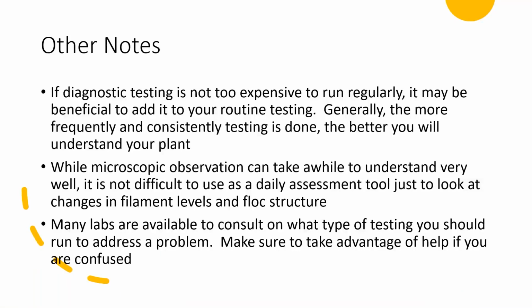So just a couple other notes. Diagnostic testing, if it's not too expensive to run regularly, it's beneficial to run it more often. If you can afford microanalysis with an outside plant monthly for a full year, you might want to go ahead and do it because you'll be able to better understand your bacterial population over a period of time, how it changes throughout the year, what sort of operational changes might influence it, and get a better sense for how to maintain a healthy population.